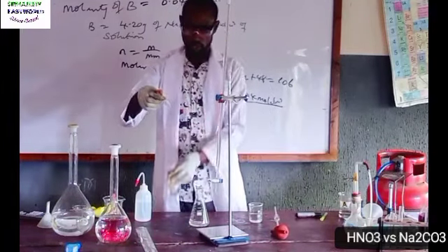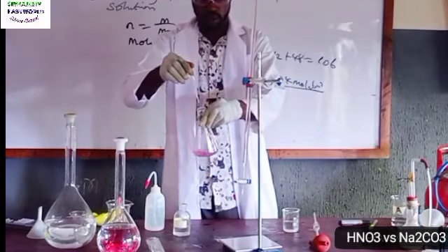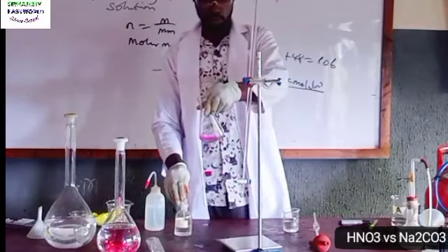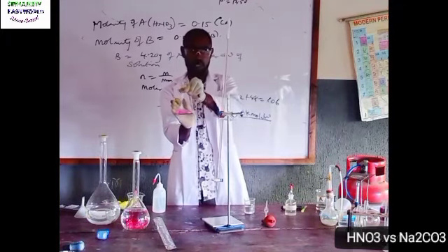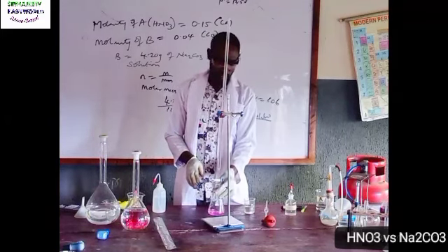And here's my phenolphthalein. The color of phenolphthalein is actually pink, or red. It's pink in base. So it indicates my endpoint when it turns colorless. It's pinkish here. So when it turns colorless, now we are at 10.5.